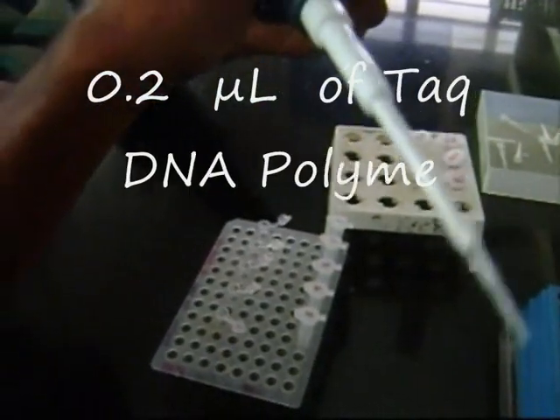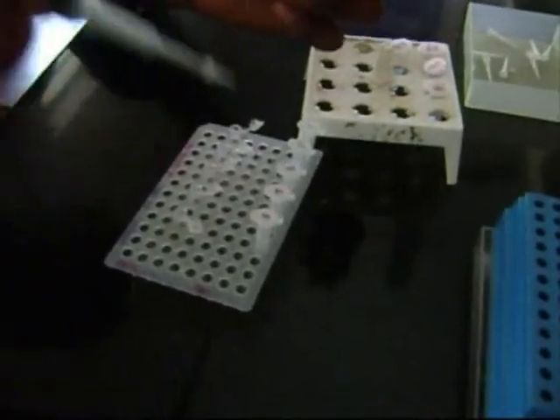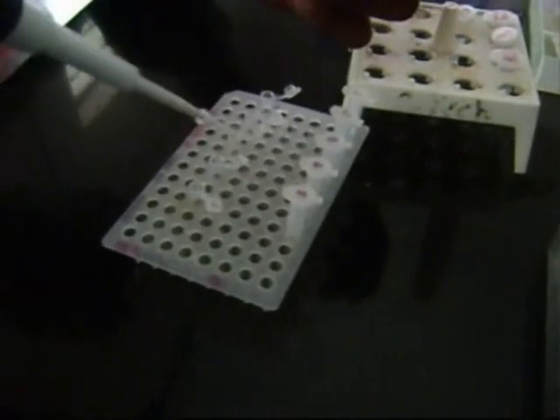0.2 microliter of Taq DNA polymerase is added to each tube. It is the enzyme that catalyzes the replication of DNA by elongation of the chain. Now the PCR cocktail is finally ready.